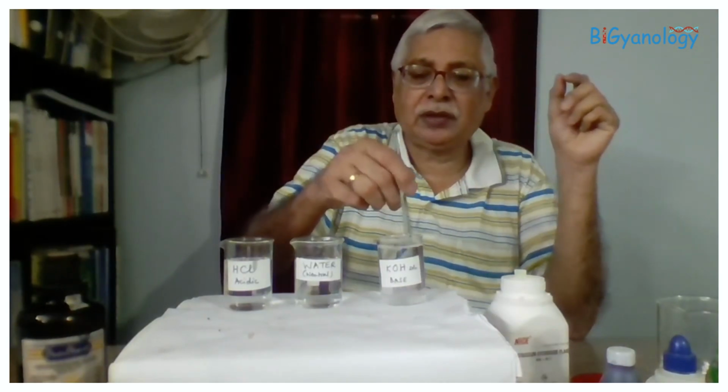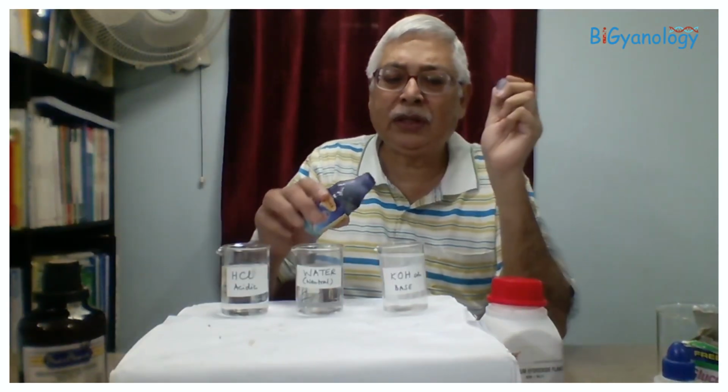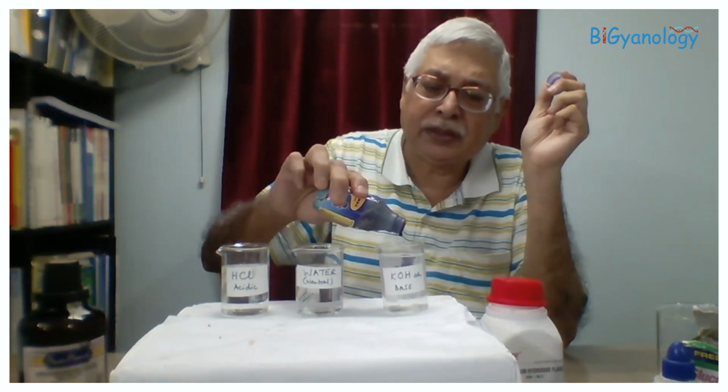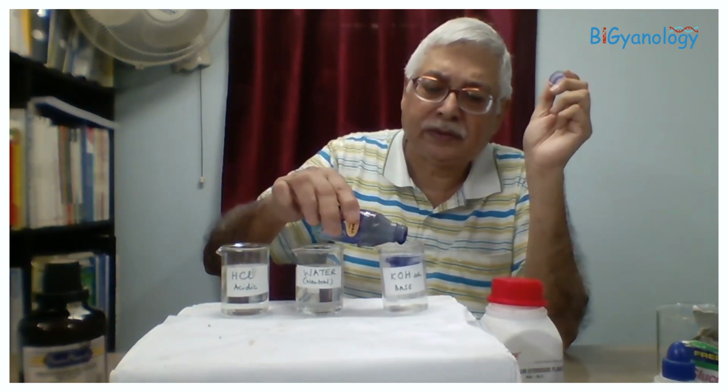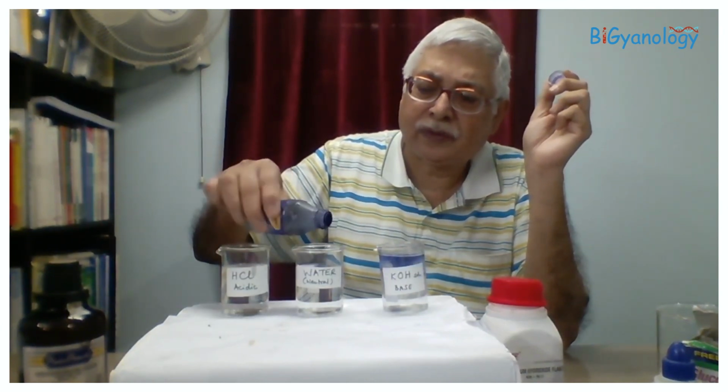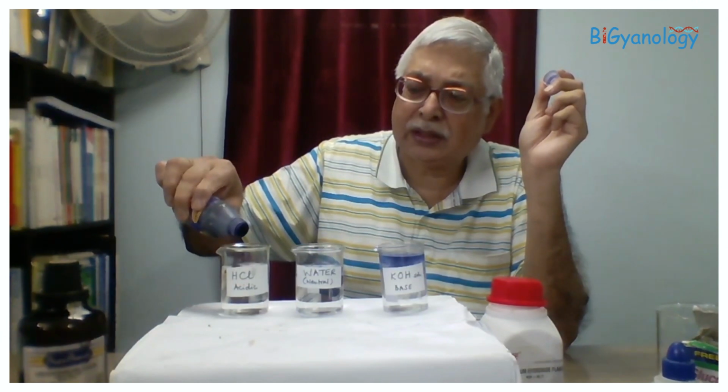So this is KOH. Methylene blue is blue in basic, neutral and acidic color.